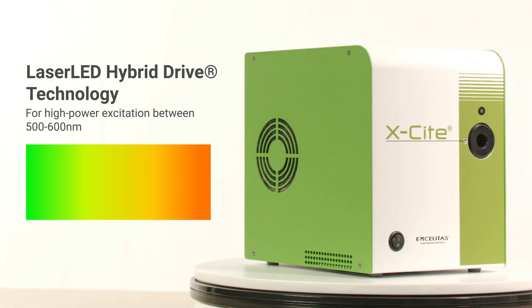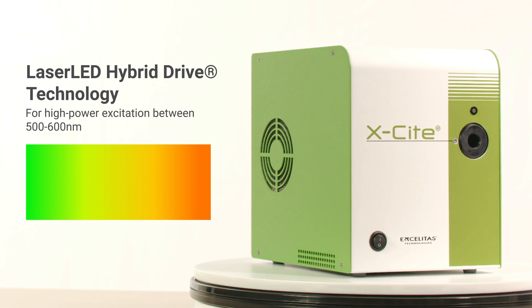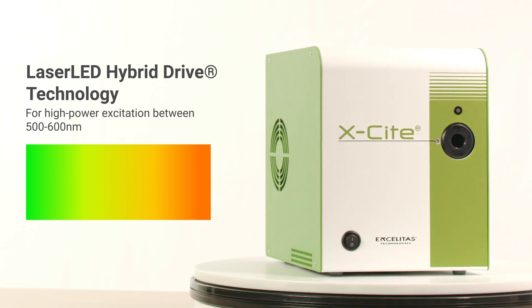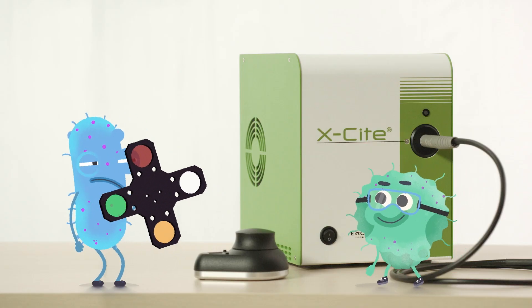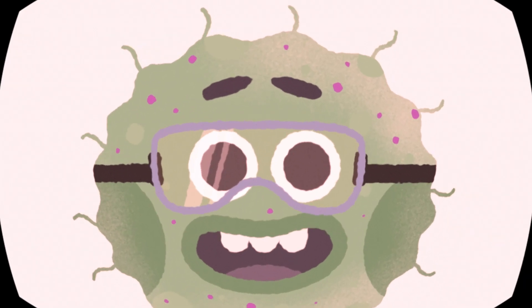The Xcite Novum features our patented laser LED hybrid drive technology for high power excitation within the 500 to 600 nanometer range, and a four-position motorized internal filter wheel for fine-tuning within that range.